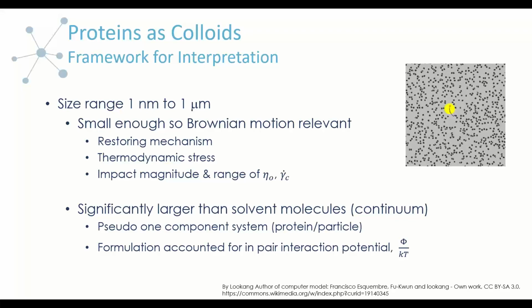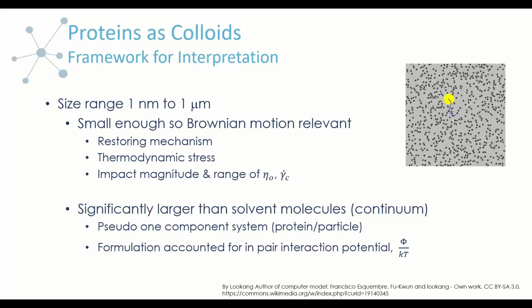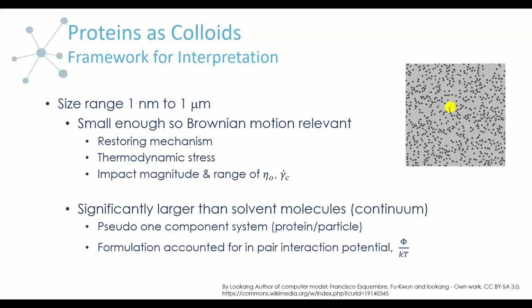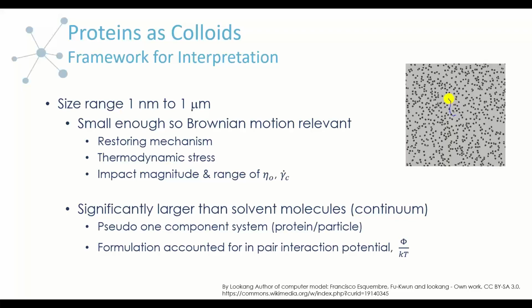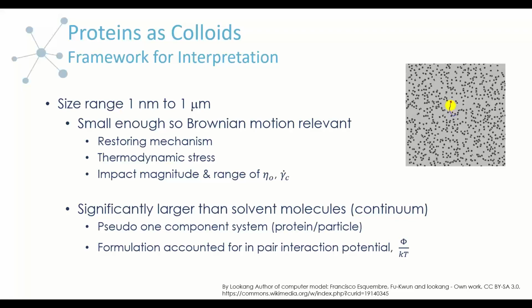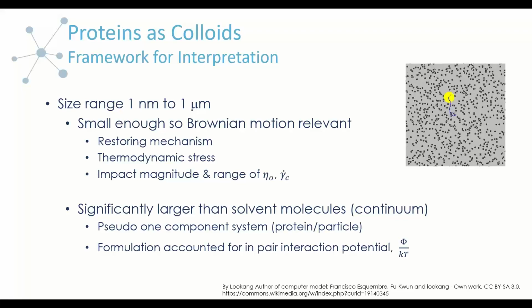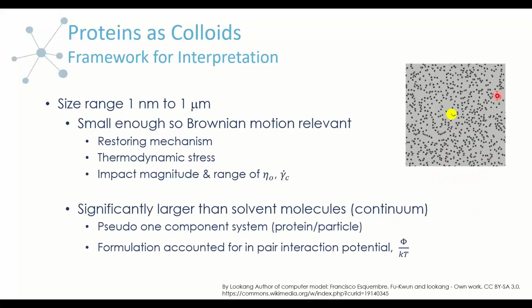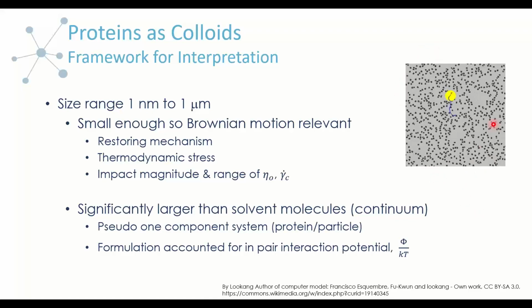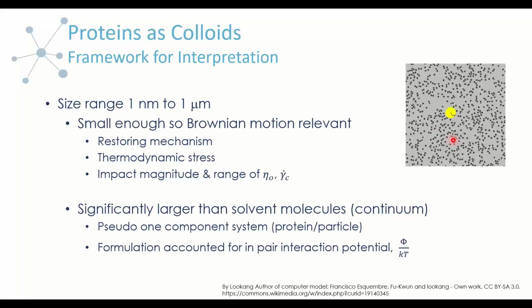With this assumption, we can gauge the interaction potential of the particles that are diffusing around in solution and interacting with each other. And this is really important for aging because, remember, these solutions are dynamic. They are not static. The particles are diffusing around, interacting with each other constantly in a Brownian fashion.